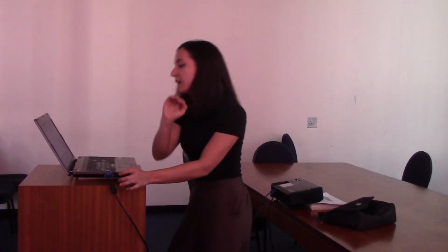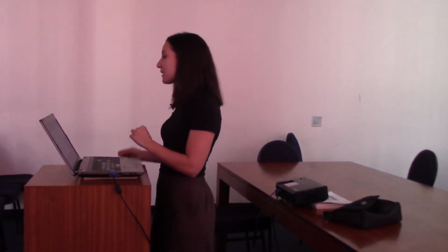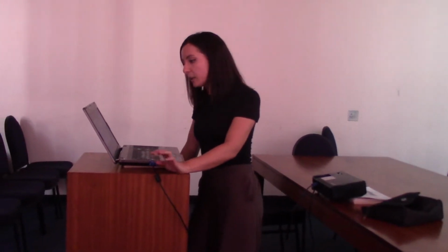I've tried to show the different pathways that you can take. And one of the biggest things with RNA-seq is quality control, your QCs at each step. You need to QC your raw reads, you need to pre-process, filter, and trim, then you need to QC the mapping, then you need to QC your counts, then you need to have the right stats in place. So I encourage anyone to talk to a statistician or someone who has experience with RNA-seq.